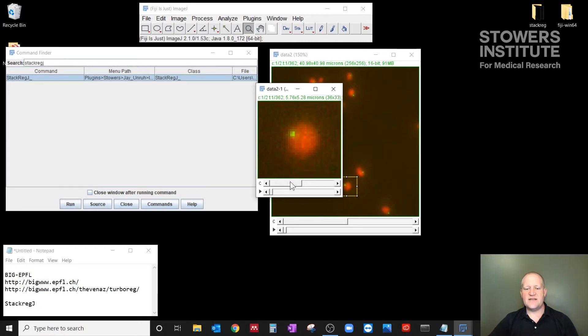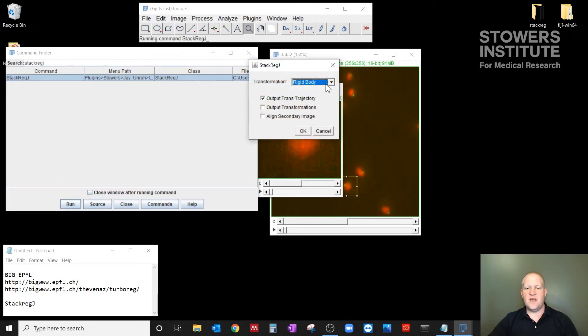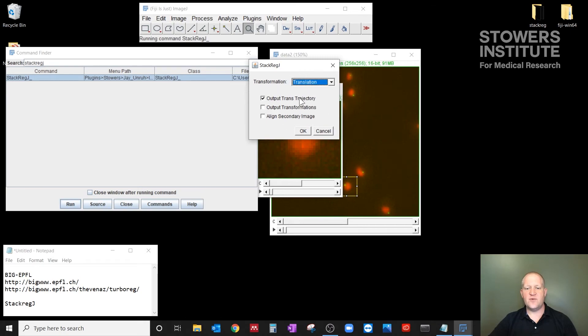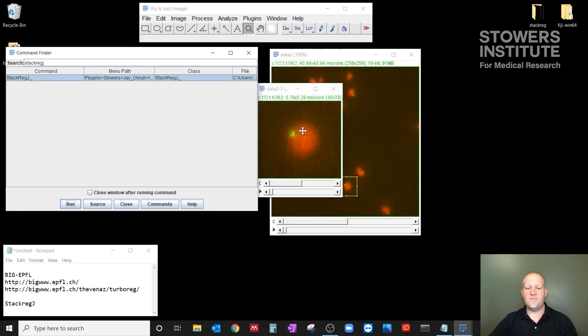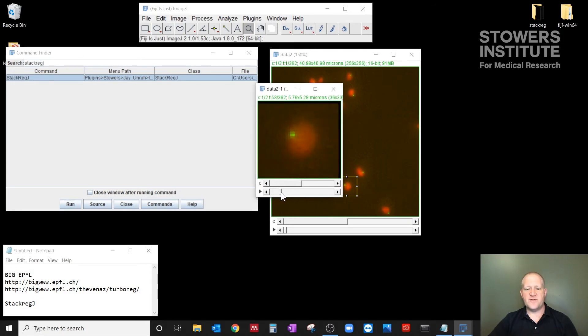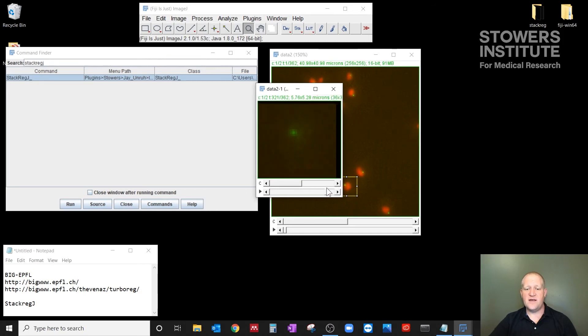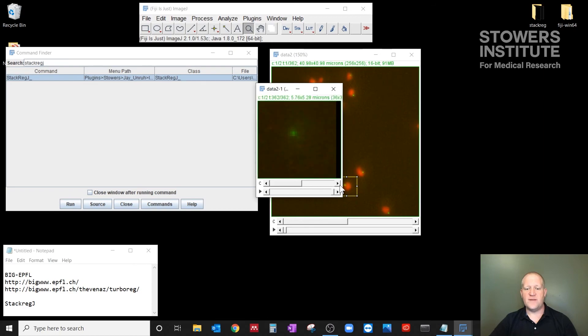Okay. So what I'm going to do is select the first channel that's green. I'm going to run StackRegJ. I'm going to change back to translation, and I will not show the output trajectory. And I'm going to click okay. And it's going to run through really fast because there's so few pixels in this movie. And now if I play through this movie, you notice that the telomere spot stays almost perfectly at the same position throughout the whole movie.